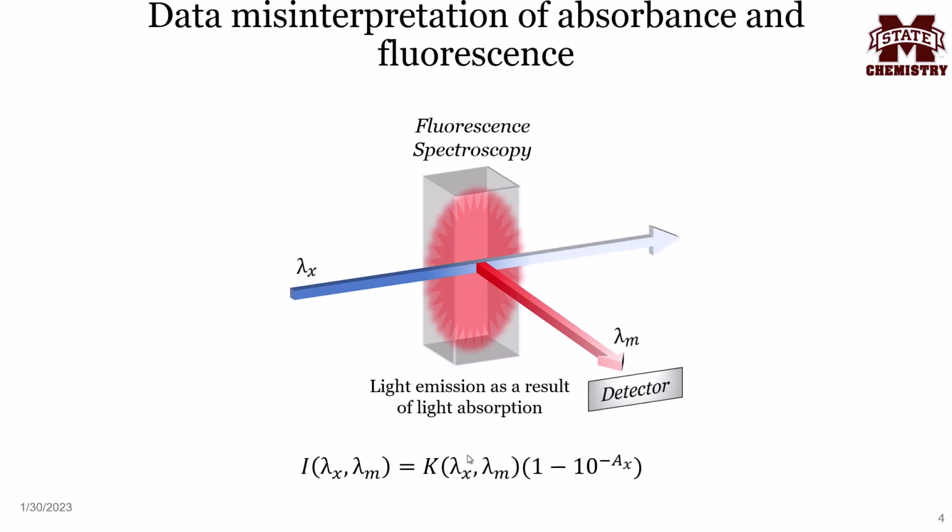After absorption occurs, fluorescence may also take place. Fluorescence is the emission of photons upon photoexcitation. Unlike absorption, fluorescence emission is detected at 90 degrees from the excitation in a commercial spectrophotometer. This is because light emission occurs in all directions, so we detect the photons at an angle where the excitation beam won't impact and interact with the detector.